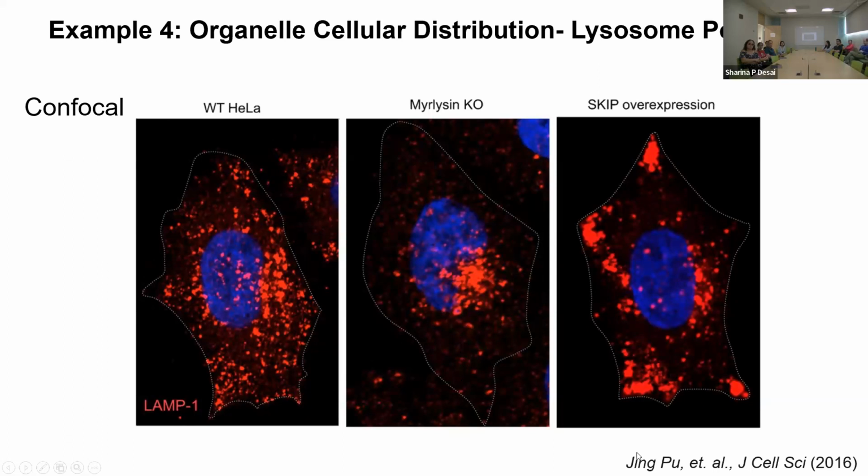And then when they overexpress these proteins, you can see more lysosomes go to the cell periphery, they go to the cell tips and accumulate there. So that means lysosome positioning can really be regulated by a range of genes, actually a lot, over 50 genes. And in natural conditions, lysosome positioning responds to different cellular environment stimuli, including pH and nutrients. Actually, nutrient is the most studied condition. When cells have a lot of nutrients, the lysosomes prefer to spread out throughout the entire cell. When the cell is starved, lysosomes cluster to the cell center in most cases, I would say.